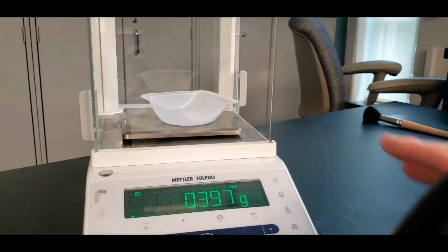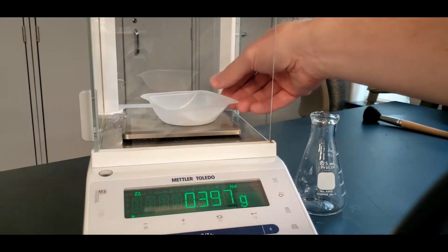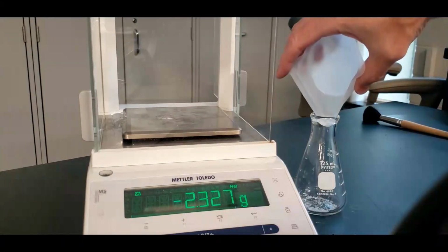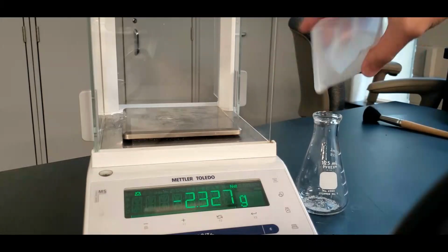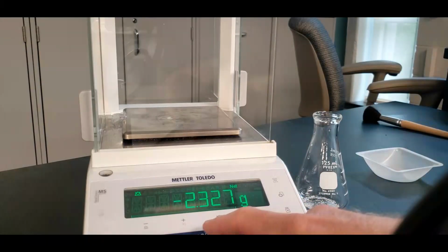So I'm going to do the one sample, and then I'll show the data for the others. So what I'll do now is take this solid acid, and it's going to go into the flask here. And then I'll do that with 2 others, but I'm just going to show this one.